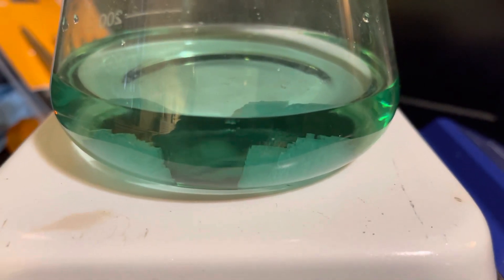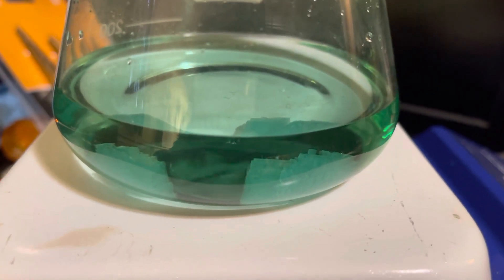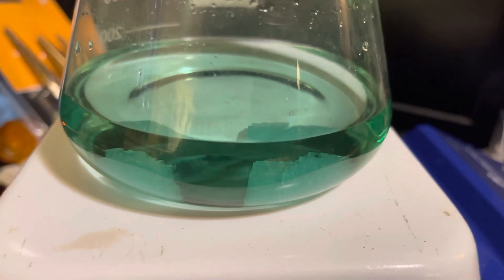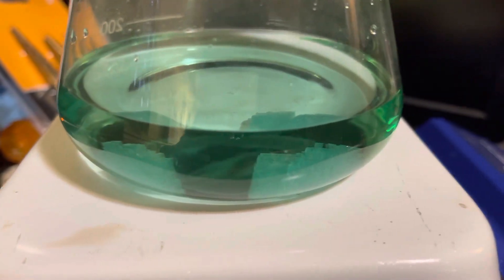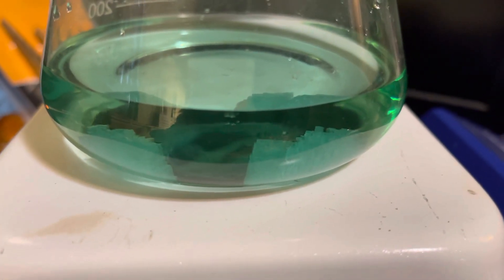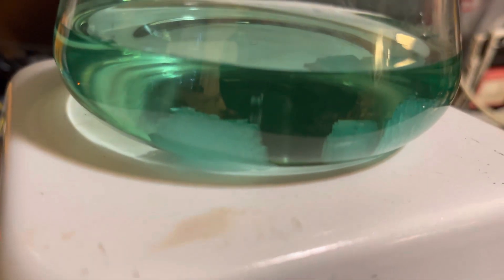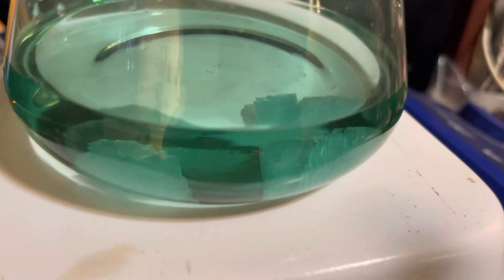The cubic pyrite that I will be forming will be visible under the microscope. If I'm lucky, I might be able to even see some of the brassy color. A lot of times I'm able to form these little hollow spherical bubbles inside of the hydrothermal autoclave, and it'll be a neat little experiment. I'm trying to make these to give to a friend so he can check them out and play with them.